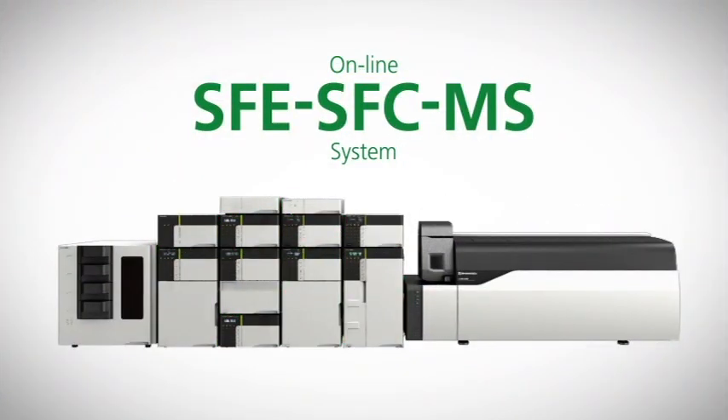An online SFE-SFC-MS system provides a fully automated analytical workflow from sample preparation to separation and detection.